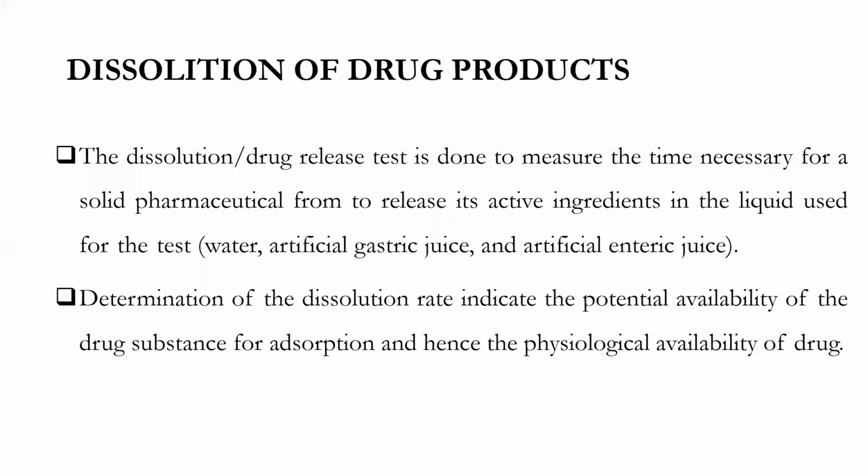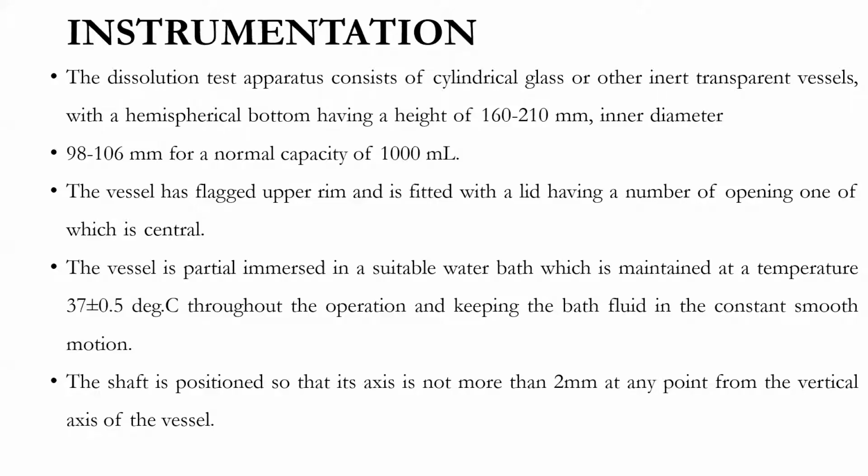Now, dissolution, as we discussed in the previous slide. When we are going for dissolution, the media are water, artificial gastric juice, or sometimes artificial enteric juice. These are the liquid media. When we are putting the tablet into this media, we need to determine the dissolution rate. This dissolution rate indicates the potential availability of the drug substance for absorption, and we also need to determine the physiological availability of the drug.